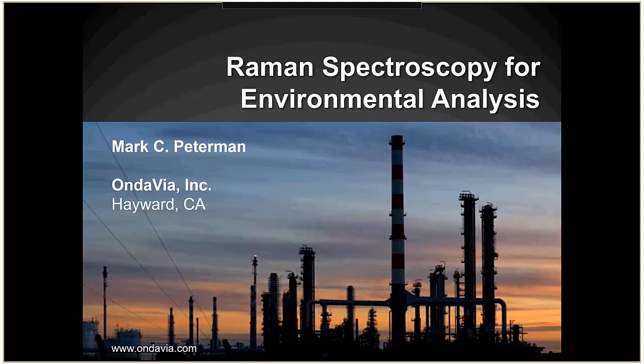The second goal here is to be an evangelist for Raman spectroscopy. It's a technique that's been around for a long time. Many folks may remember one day in an undergrad chemistry course hearing about it, but never have thought about it again. Well, Raman has really developed since the turn of the century, and has seen tremendous growth. And some of the tools we've brought to the table move it into being useful in environmental analysis. So I'm evangelizing a bit for Raman in general. If it's a tool you haven't looked at for a bit, I recommend reading up a little.